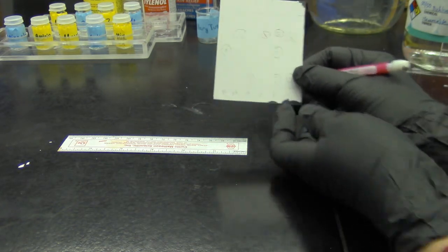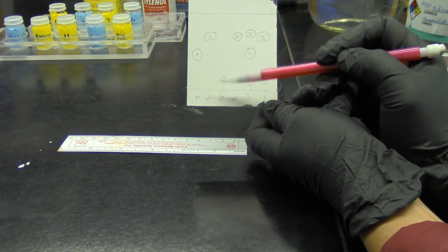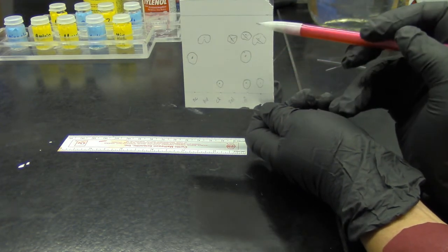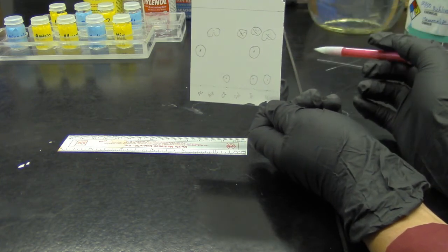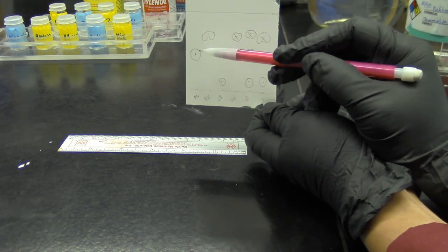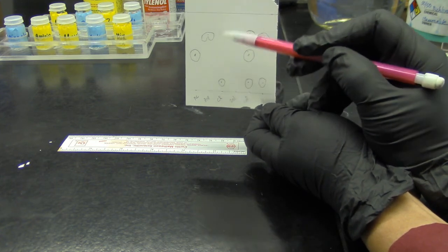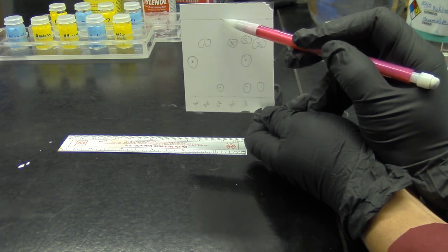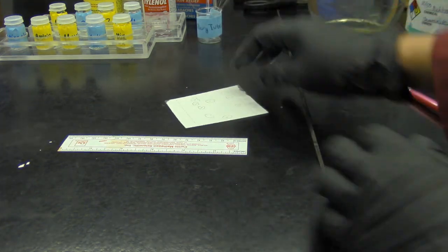So next we have to measure how far these compounds traveled up the TLC plate, right? So we need to calculate the RF value of each compound. The RF value is the distance traveled by each compound divided by the distance traveled by the solvent front, right? So I drew a line on the top here. That's the solvent front. So I have to measure those. All right, let's do that.